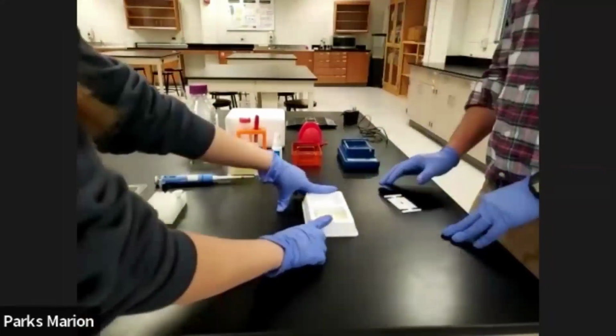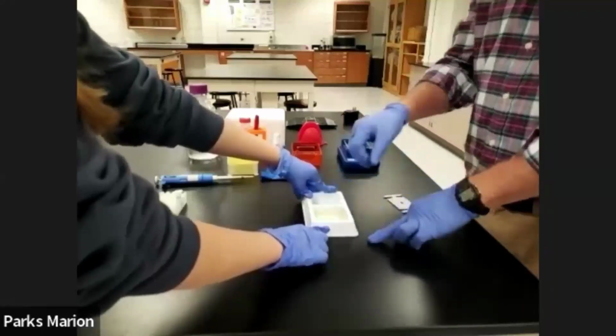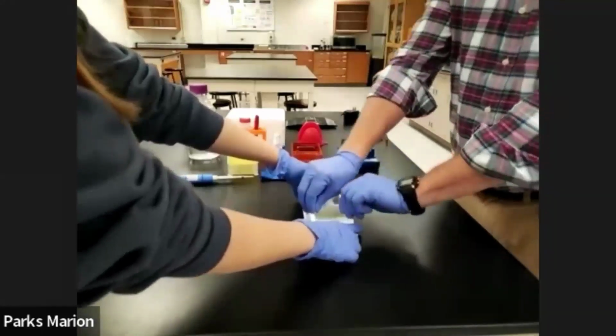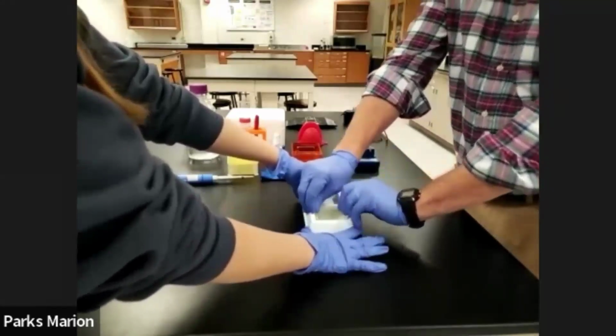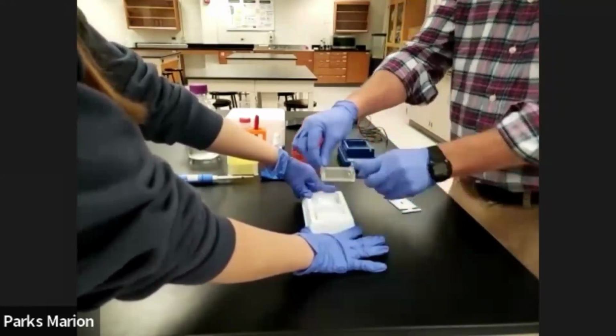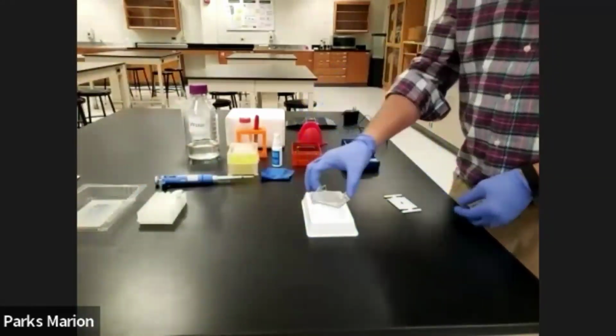Next, to pull out the tray, your teammate's going to stabilize the casting form, and you're going to reach in and pull straight up, like so. Now our gel is ready to go into our machine.